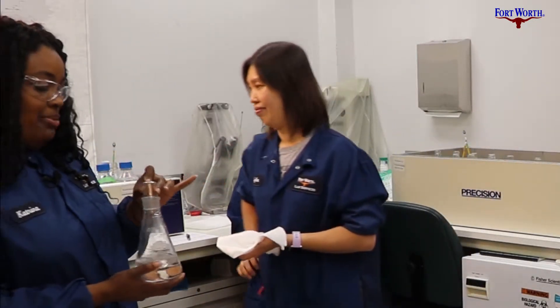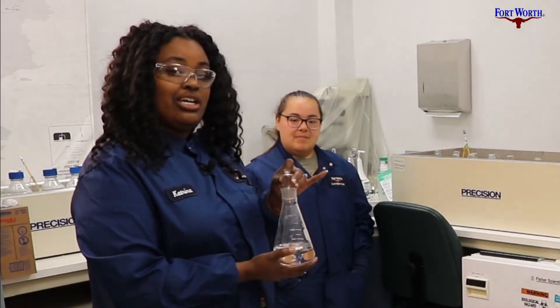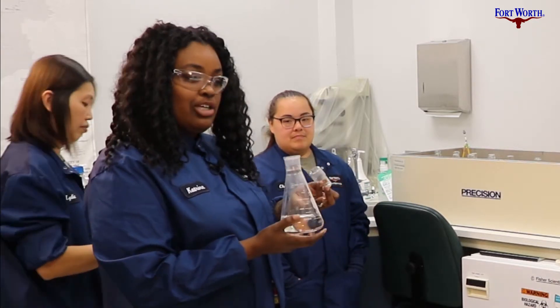So while we're doing our panel test, we are quiet, we smell, and then when we're done we talk about what we thought we smelled and we come to a consensus on what odors are coming from the water.